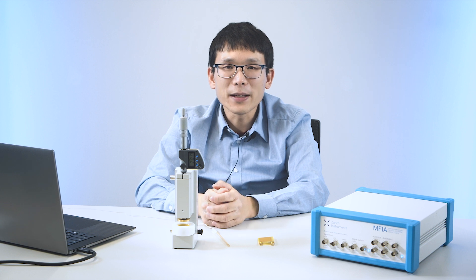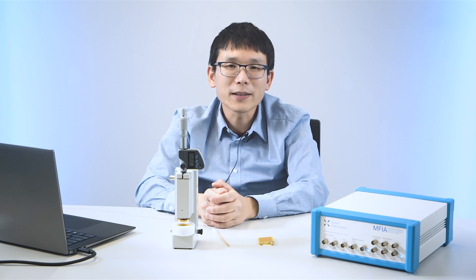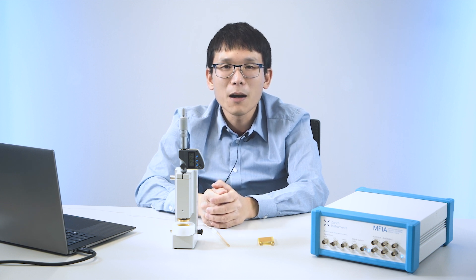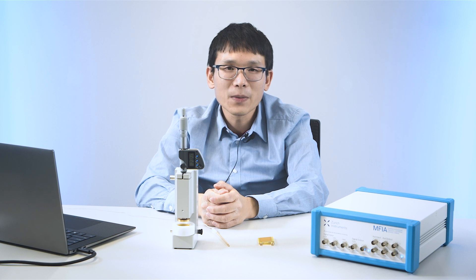You might be familiar with impedance measurement of solid-state materials, but how do they look like in liquids?